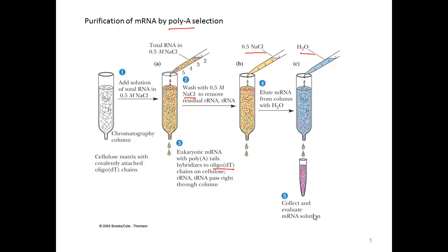You'll recall that the reason this is good at breaking the hybridization between oligo-dT and poly-A tails is that RNA and DNA are polyanions. Like charges repel. Without the positively charged sodium present, you have no screening counterions to electrostatically stabilize the interaction of these two polyanions. So in pure water, double-stranded nucleic acid structures dissociate. That's going to release the mRNA into a tube, a highly purified mRNA fraction into the tube.